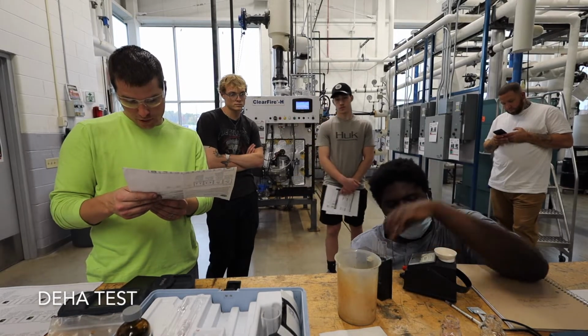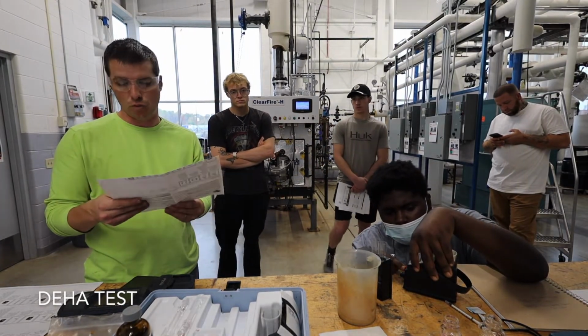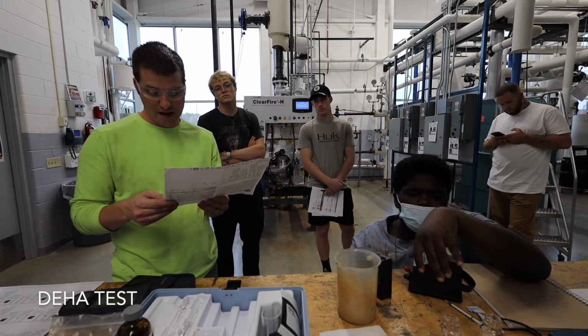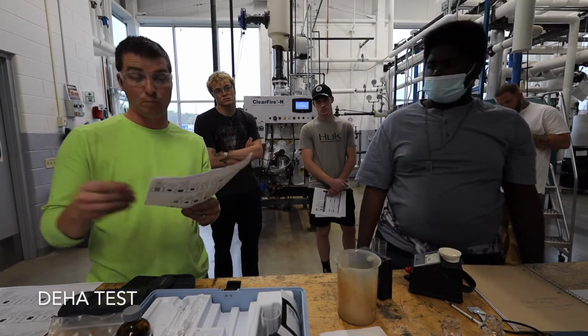If the match is between two segments, use the middle value. So between 5 and 10, they want me to use 7.5. Well, we're going to do 5 for easier math. Then multiply the value in the scale window by the applicable factor from table 1. Results are in micrograms per liter or parts per billion.